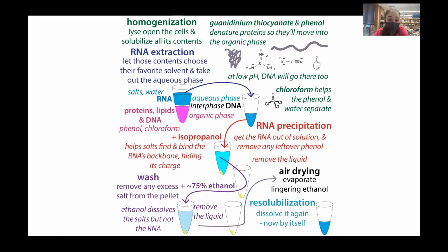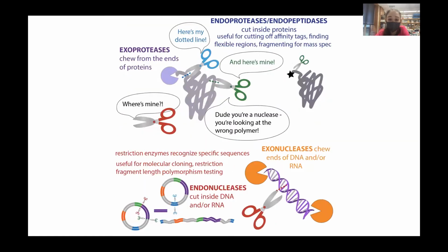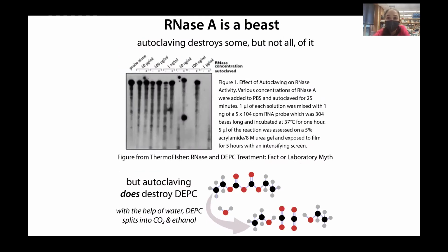So before we start, some key things about working with RNA. You need to be really careful to avoid contaminants. There are these things called RNases, which are basically out to get you and out to get your RNA. They're kind of like RNA scissors, and they're basically everywhere because a lot of viruses are RNA based, so all of our cells and the bacteria make these RNases to try to prevent RNA-based viruses from messing with them.